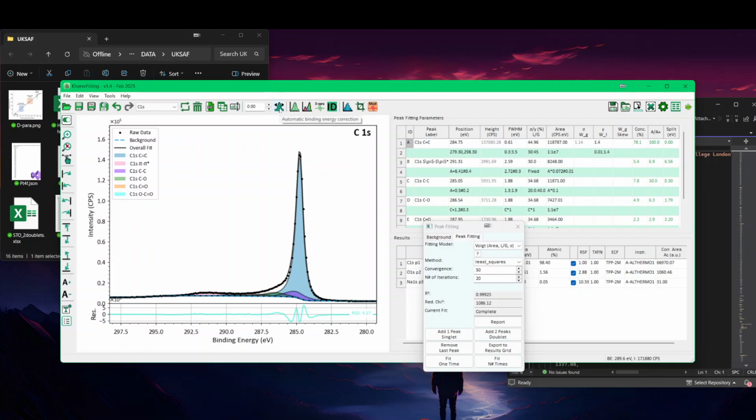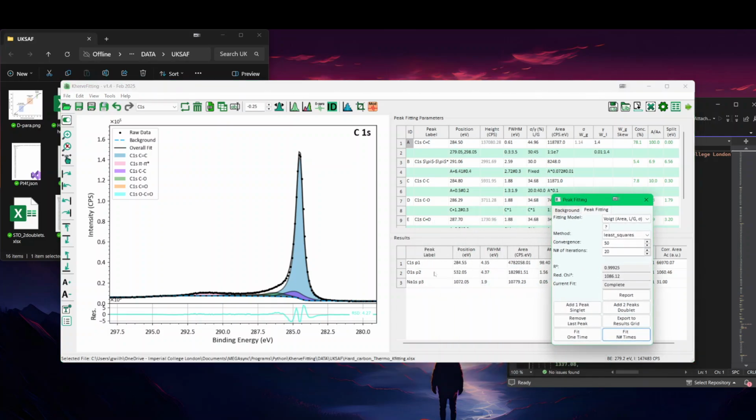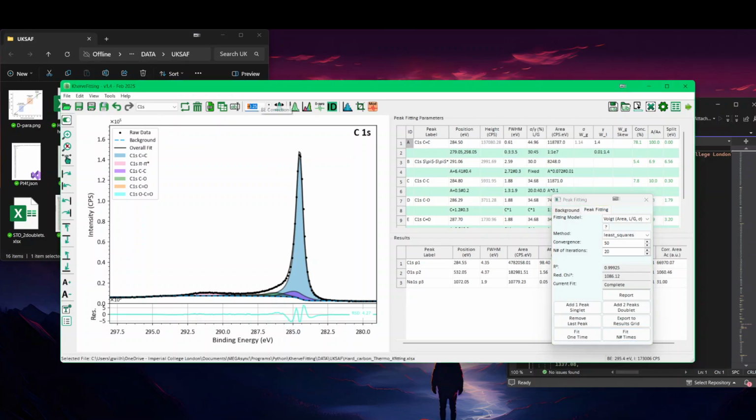But let me show you. So if I do it here, you can see this is being changed everywhere in the program. Everything has been shifted to get C minus C. But if you don't want to use this one, so let's go back to 0 again.